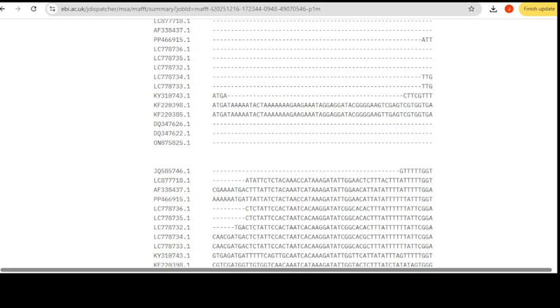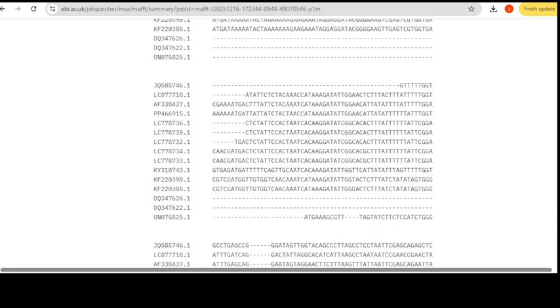So let's see if we can find a way to make these really visible to us in one straight line. All these 15 or 20 sequences, I'm saying 20 because we downloaded 20, and the other 5 are missing, they may exist downward, okay? If we go further and drag down, some might end and some other might start, because it depends where it matches. So it will then align them right at that particular location.